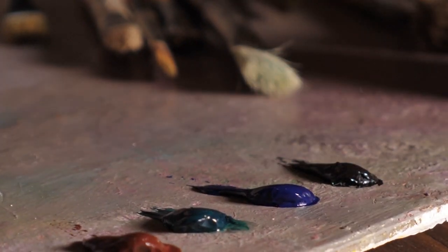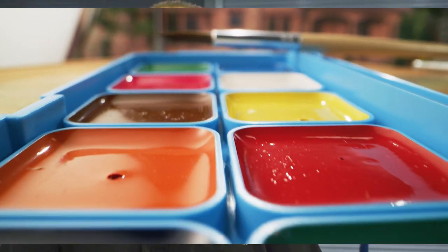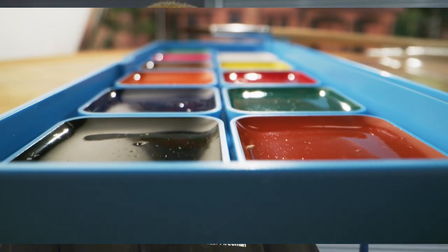Understanding which materials have been used, you would have an understanding of what was available at the time, and there's quite a big difference between historical pigments and paints that were used, compared to modern day pigments and paints.